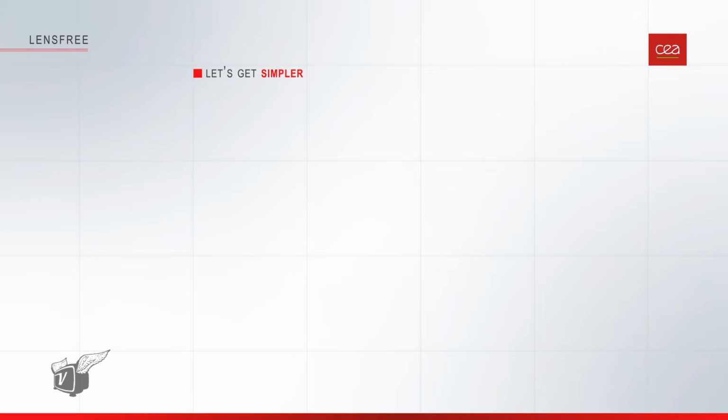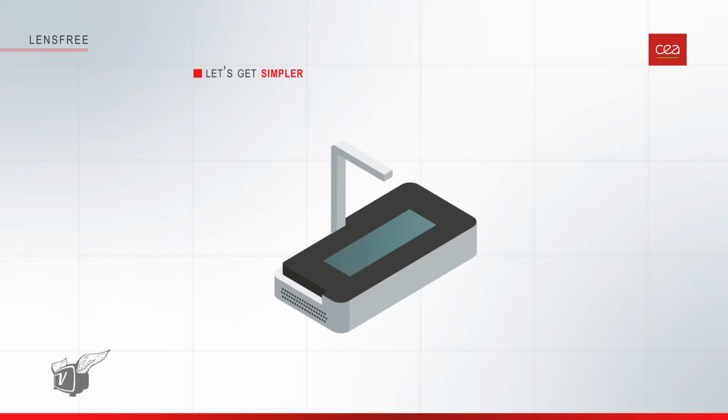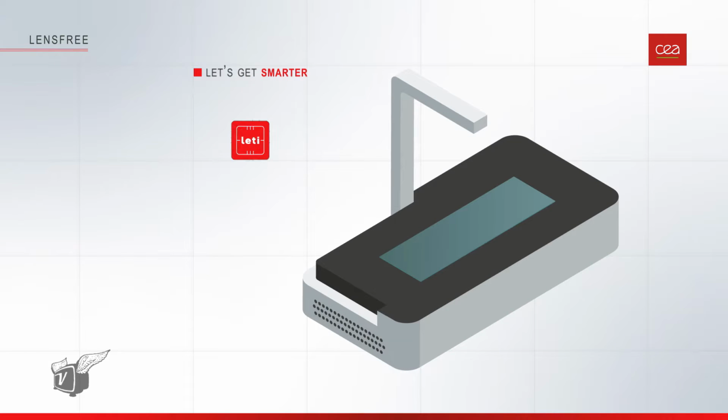And why is it so small? Because we have removed the lens from this system. So we do not have any objective inside the system, and you just have a LED and a CMOS sensor, and we have replaced the lenses by a reconstruction algorithm.